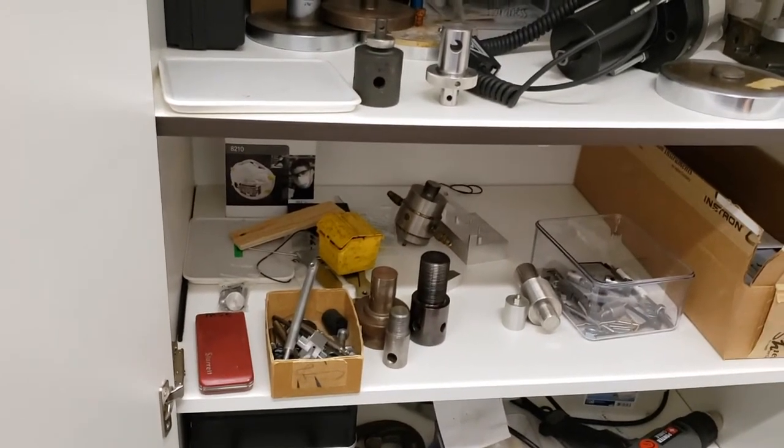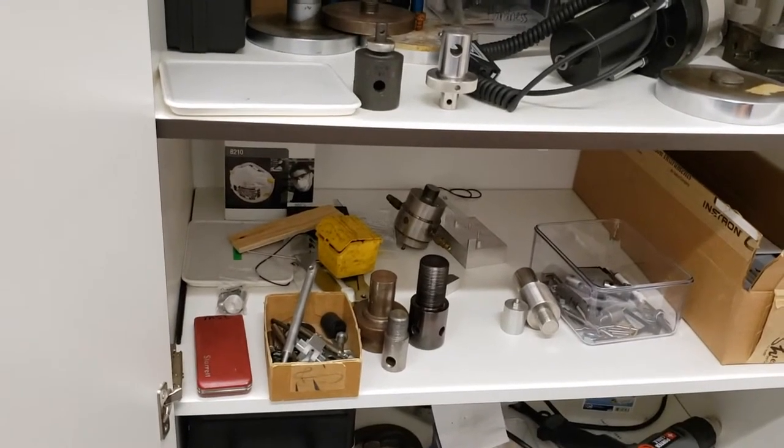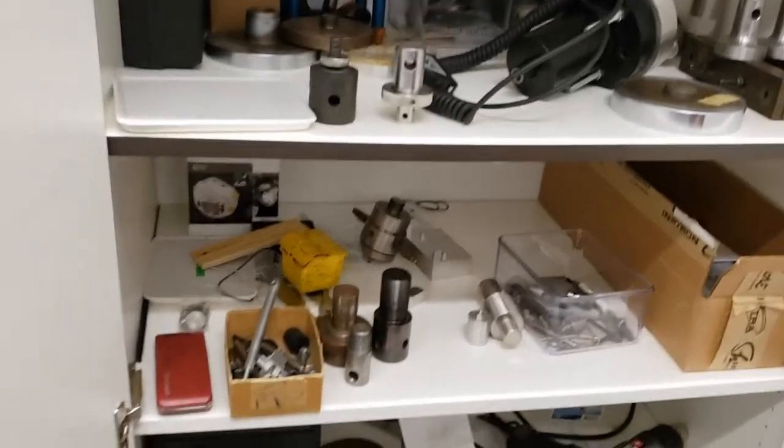A note: whenever you're using the Instron, you should be wearing safety goggles. Safety goggles are located on the front desk in the front room where you entered the MCL.